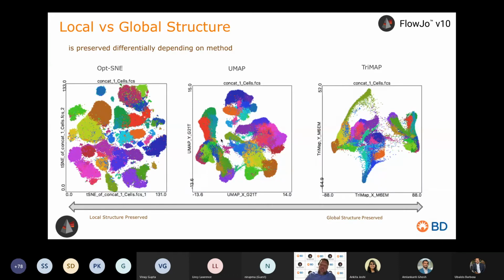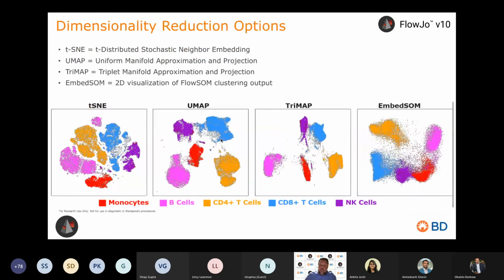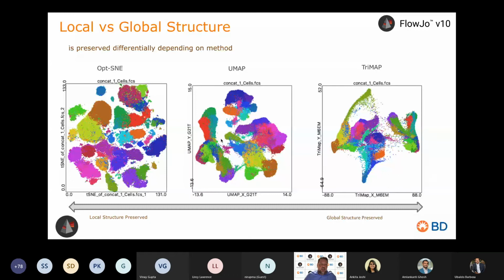Now I'm going up into 28 color world, right? So from 18 color world with all the lineages represented, this is a pan-immune panel. So we've got NKs and Bs and Ts all marked with their lineages, and then there's some additional subsets downstream. Now this panel focuses in on just T cells, T cell memory subsets, and then downstream effector functions. And so this is actually an OMIP, a high parameter published panel in Cytometry Part A, where the data is publicly available on Flow repository. You can download it yourself and recapitulate this.